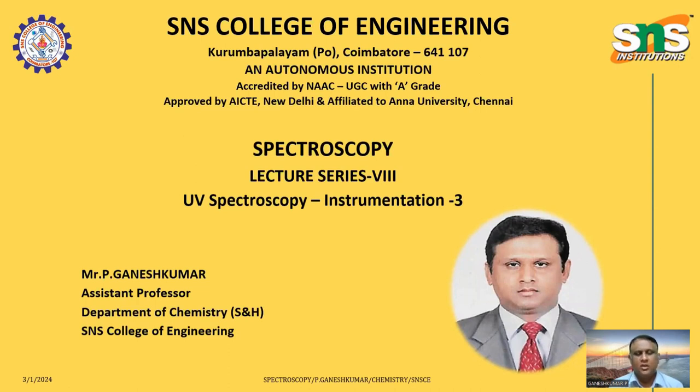We were discussing ultraviolet spectroscopy instrumentation. The instrumentation part 3.